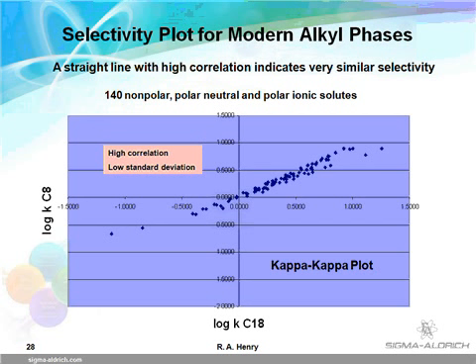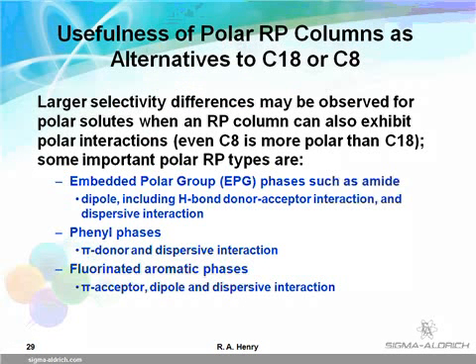Modern C18 columns have become very similar in selectivity, even for basic compounds, because silica quality and bonding techniques have improved to the point that silanol effects are minimal. The main reason for looking at two C18 columns would be for improving peak shapes and gaining a minor change in selectivity. Even if successful with one C18 over another for a difficult separation, lot evaluation should be conducted early during method development. The next slide describes some types of chemical interaction that can occur between sample and stationary phase.